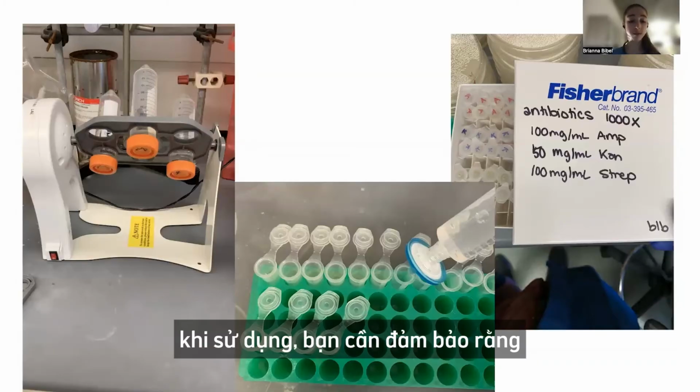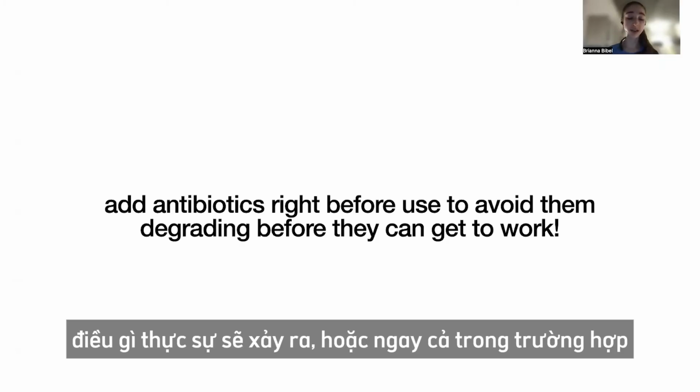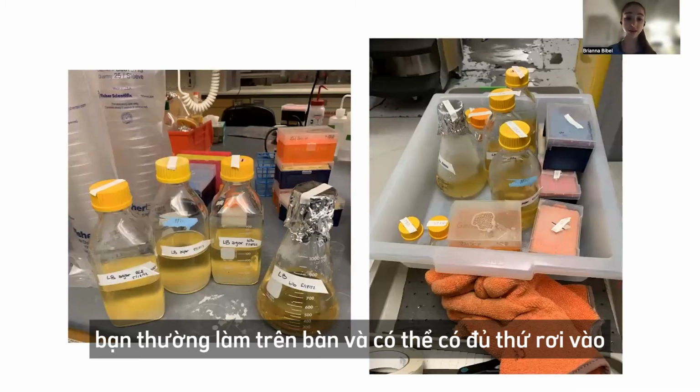Then you make these aliquots and store them, and now you have them ready to use. When you go to use them, you want to make sure you add them right before you use them. This is especially important when you're making LB agar plates. You're going to sterilize the media first, because when you're making these mixtures, you're typically doing it out on your bench, and there could be all sorts of stuff getting in there.